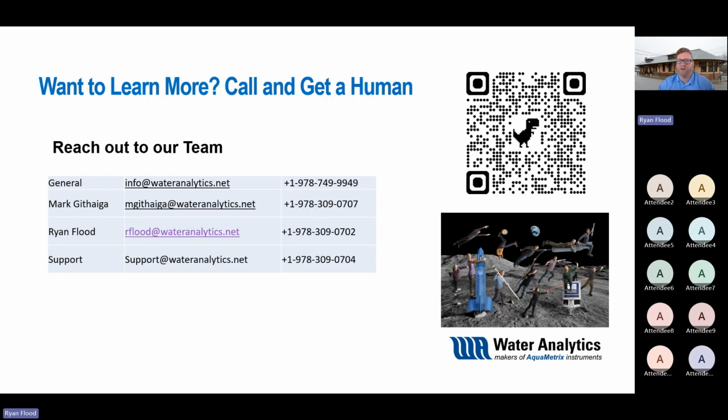Mark, are you seeing any questions coming in here? Question: You talked about the 2-point calibration, and the question we have is, do we offer calibration standard solutions for conductivity? Great question. So we have taken that off of our price book, but that is something we can continue to provide for you as our customers.